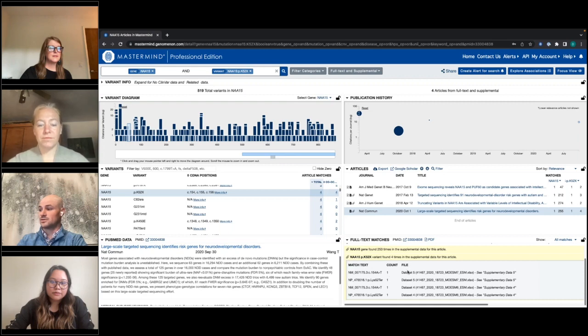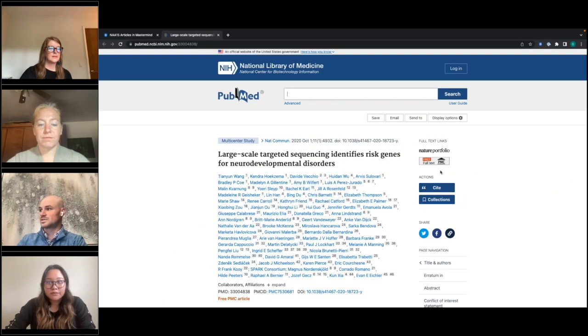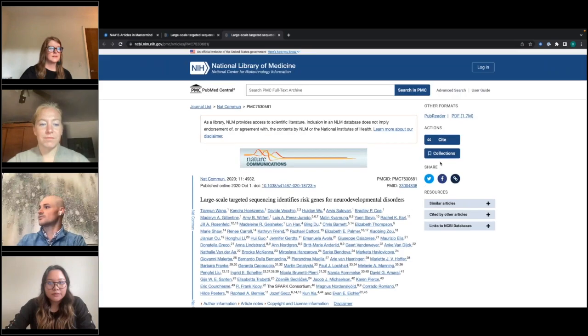We show the supplemental file where that match was found, as well as the tab in the supplemental file. So let's use this first example. I'm going to copy this nomenclature because that's what was found. I'm going to click this little hyperlink here to launch the PMID. Once that loads, I'm going to click find the full text free.